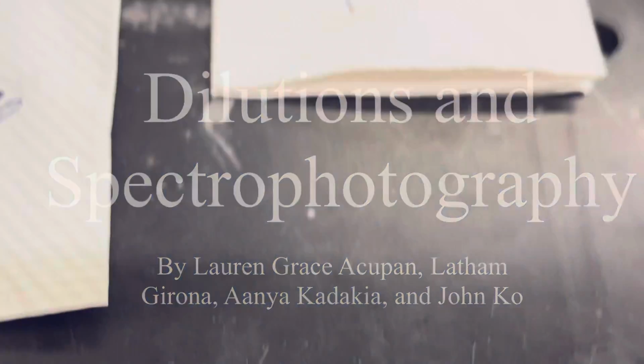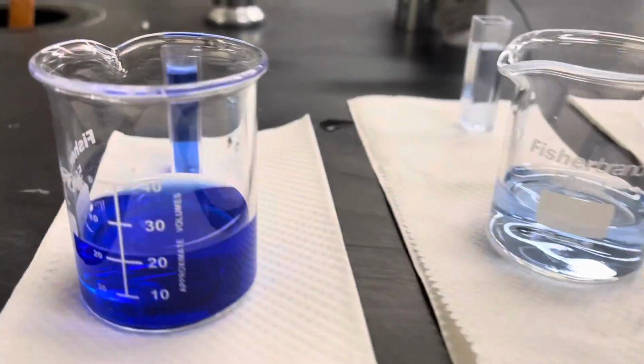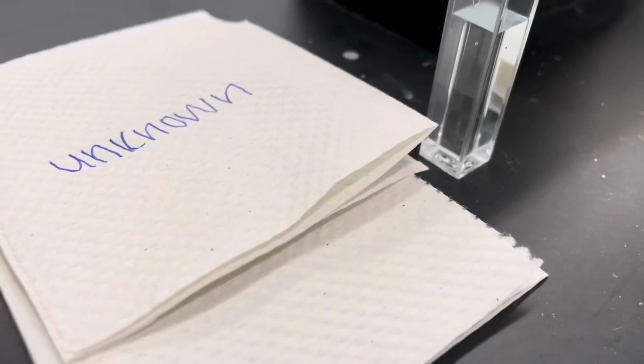Our lab was over dilutions and spectrophotometry. To start our lab, we first made our 3 dilutions. We transferred them into our 3 cuvettes until the meniscus reached the mark and did the same for the unknown.